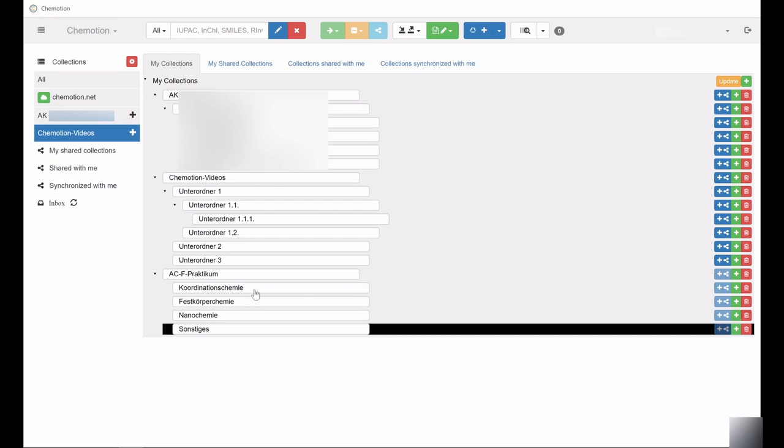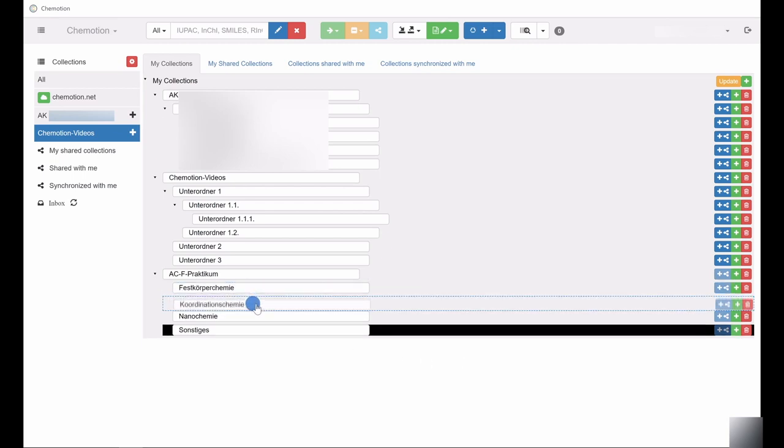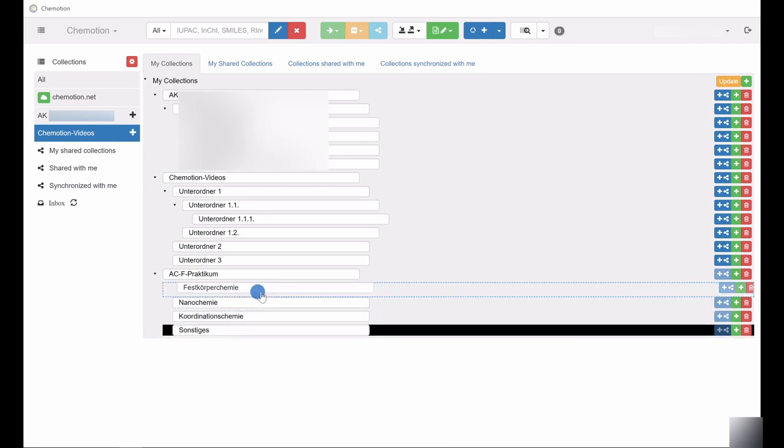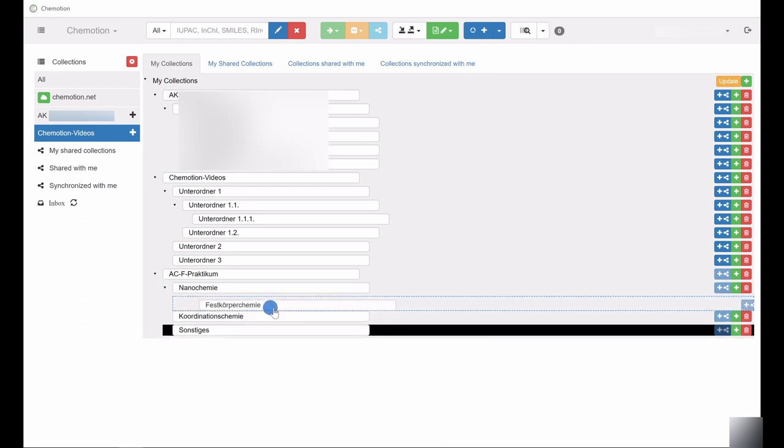Simply drag and drop the created collections to move them as desired and reassign them as parent or subfolders.